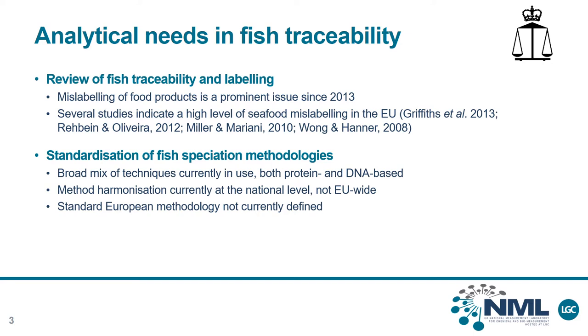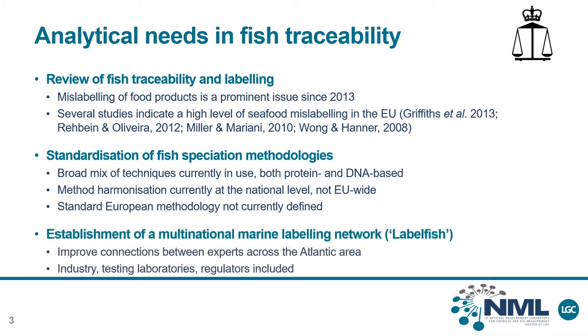Harmonisation of methodologies has only occurred at a national level, indicating a requirement for an EU-wide standard operating procedure. The establishment of a multinational network could improve industry connections and coordinate a response to seafood mislabelling. The Labelfish project was started with an aim to address the analytical requirements in fish traceability.